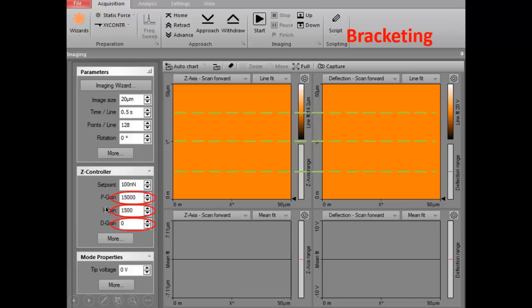Return the setpoint value to its initial value and bracket the PID gains. When bracketing one of the PID gains, the other two should remain at their initial value. The bracketing process is similar. Different thing is, when bracketing the gains, you don't have to change it by a factor of two. And you might start to change it for just a few lines at a time until you know how it works.